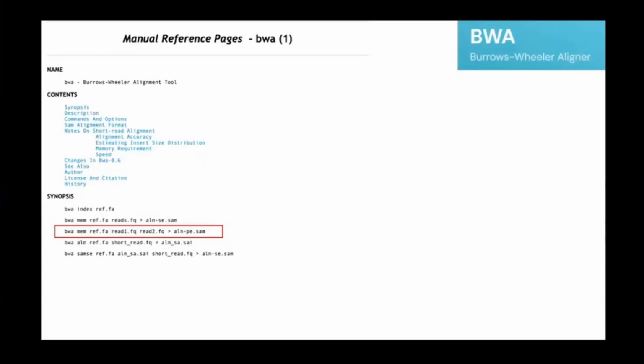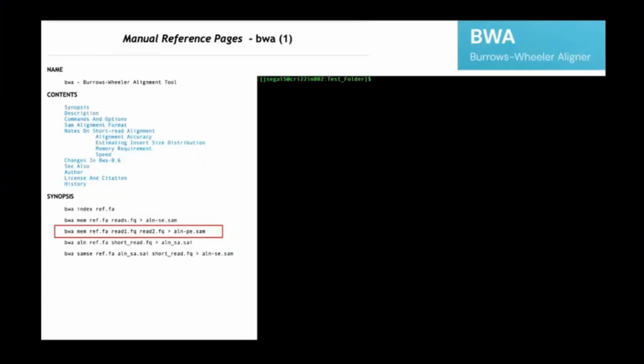And the simplest way to use this software is to be working in a command line Linux system. This is how most bioinformaticians work most of the time. It's just a text-based operating system, so it's just a text-based way to use a computer.